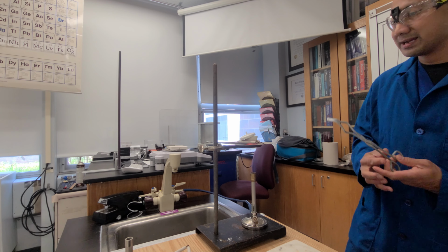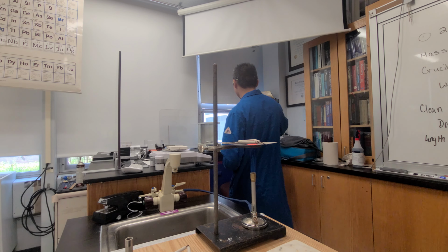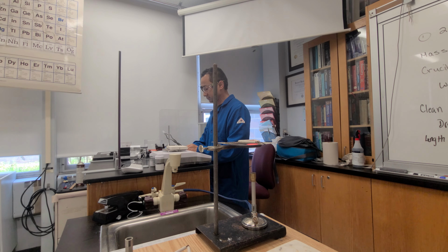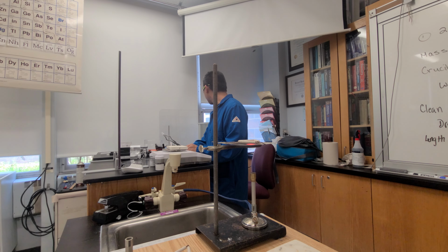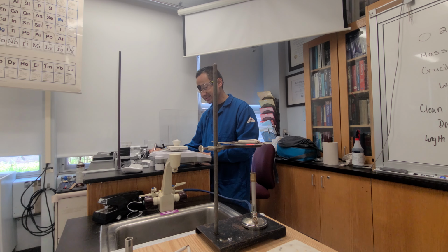What I am going to try doing is, we'll see what happens, I put this on here. So 37.95. I'm going to see what that is. What we got before is 37.96, and we got 37.96 as well. 37.97. So I think that is pretty good agreement. So 0.01. Not bad at all.